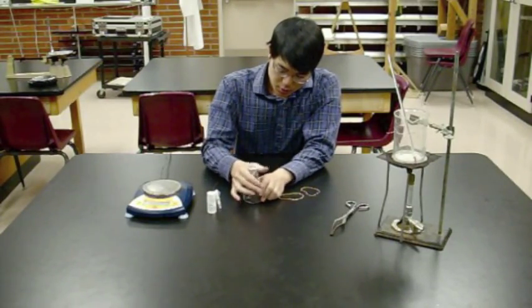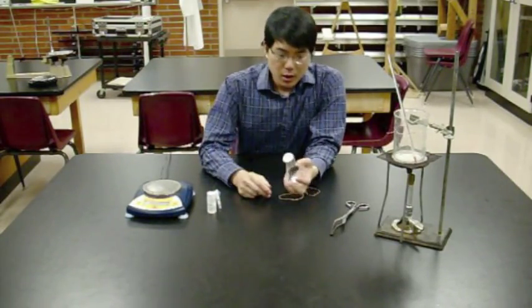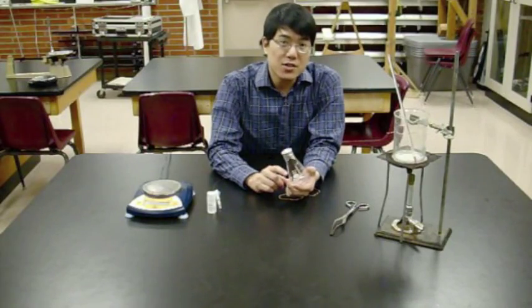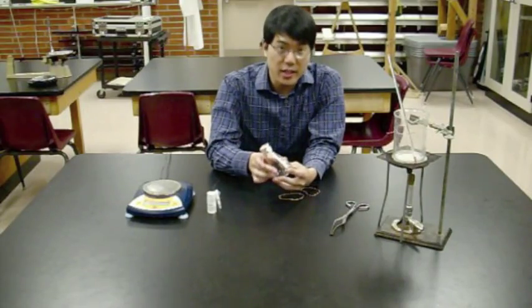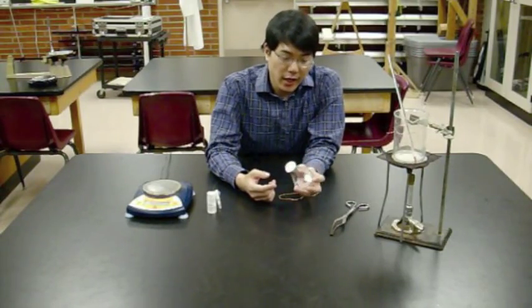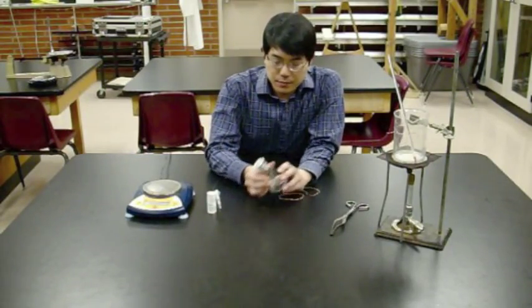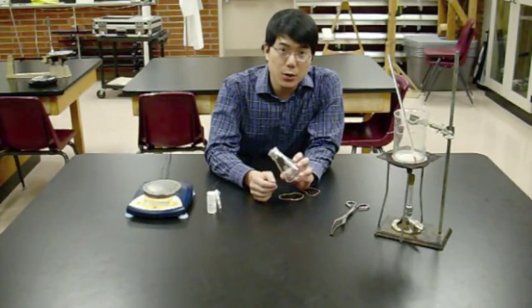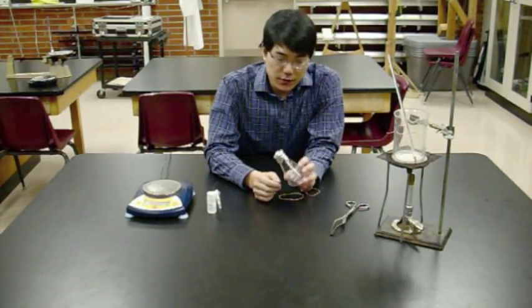The goal of this section is to measure the mass of the vapor once it's inside the container. The container is only about 150 milliliters in volume, and gases are very low density, so this section is very sensitive to errors which cause changes in mass.